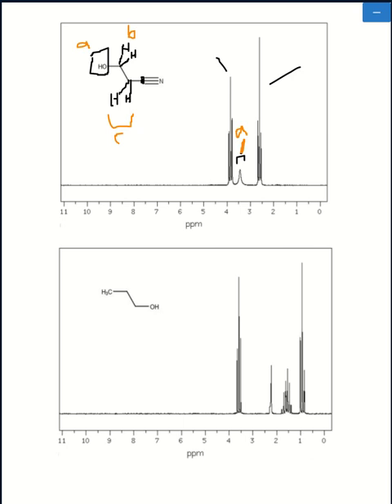They have a situation where hydrogen, as part of an alcohol group, can be exchanged, or can essentially leave the molecule rather easily. Therefore, that's what causes the peak for the alcohol hydrogen to become more broad, because it can actually leave the molecule more easily and then come back on. Hydrogen that are more stuck to the molecule, wherever they are, will show up as very straight, very neat peaks on an NMR.